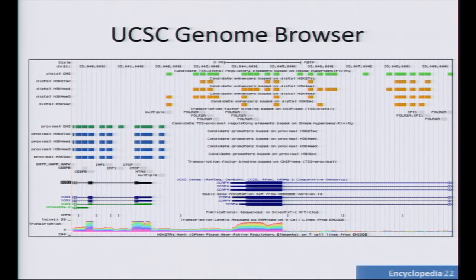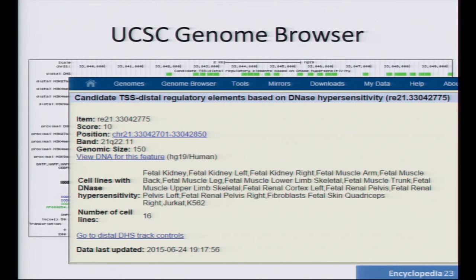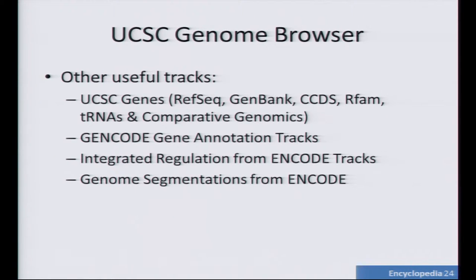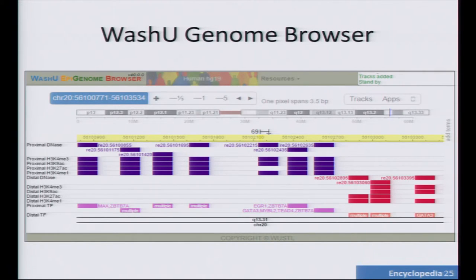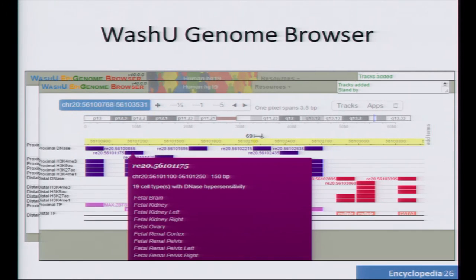This is what it looks like in the UCSC genome browser. If you click on one of the annotations, you can get things like — for instance, if you click on DNase — all the cell types involved in that region, just as promised. When using these tracks, you may want to enable some other tracks in UCSC, which can be quite helpful to figure out what is actually going on in the region. For WashU, the annotation tracks look similar and you can click on each peak to get the list of cell types without having to open a separate window.